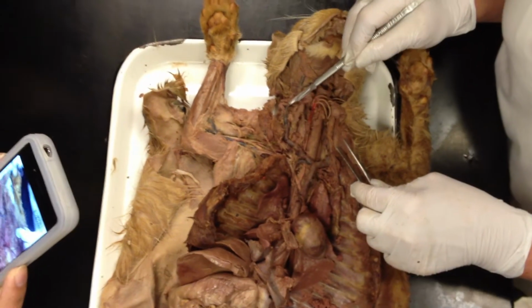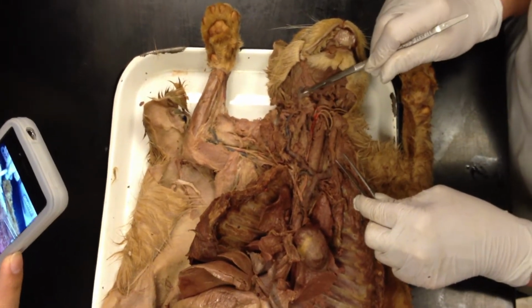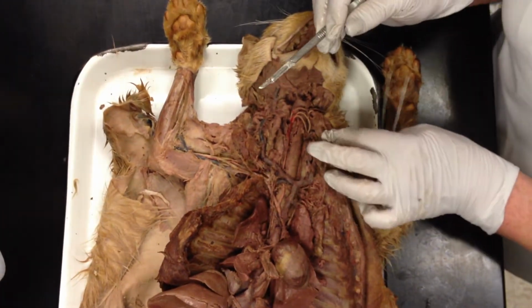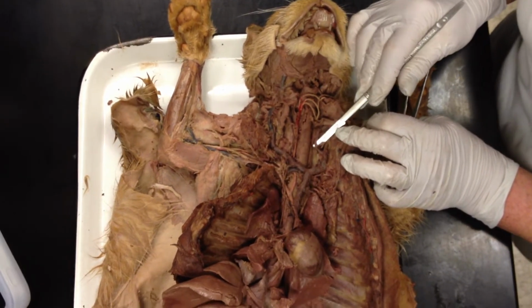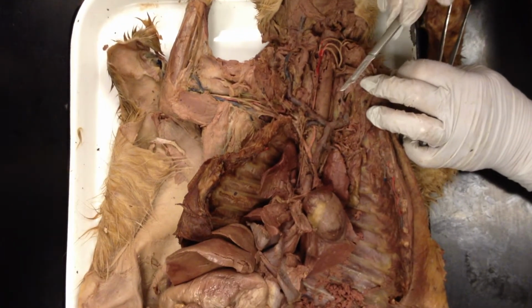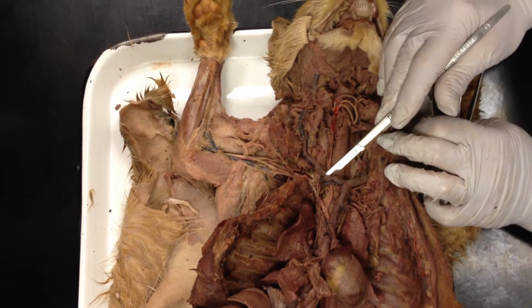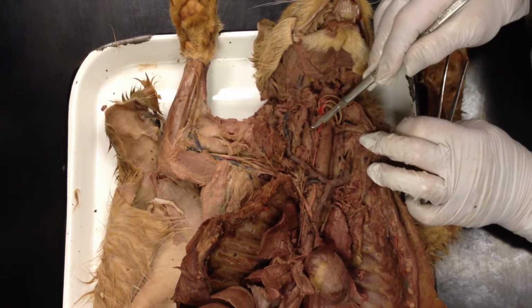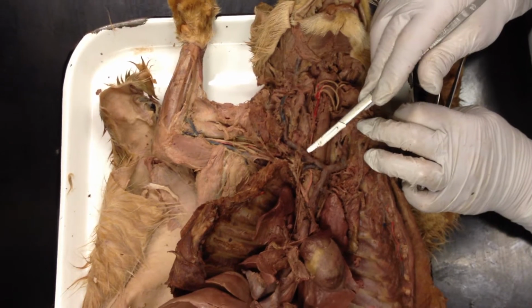So external jugular meanders out around the cheek, as you can see over here. You will have an internal jugular on some cats, and this one is the internal jugular. Unfortunately, it didn't get much blue, but you can also see a little remnant of it on the right side, but it's been broken. A lot of times they don't get much dye, so they rupture.